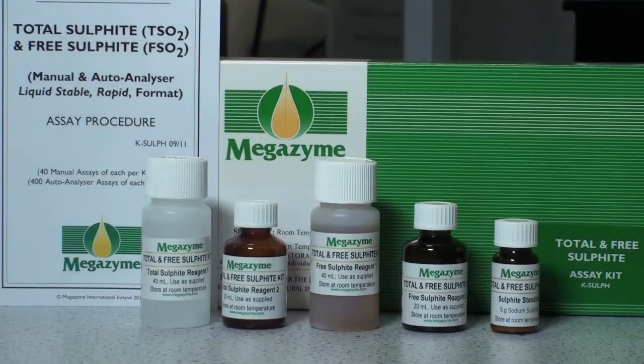The Megazyme Total and Free Sulphite Assay Kit is suitable for the specific measurement of both Total Sulphite and Free Sulphite, especially in wines, beverages and foodstuffs. This kit is suitable for performing 40 assays of each test in a manual spectrophotometer format, or 400 assays of each test in an autoanalyzer or microplate format.